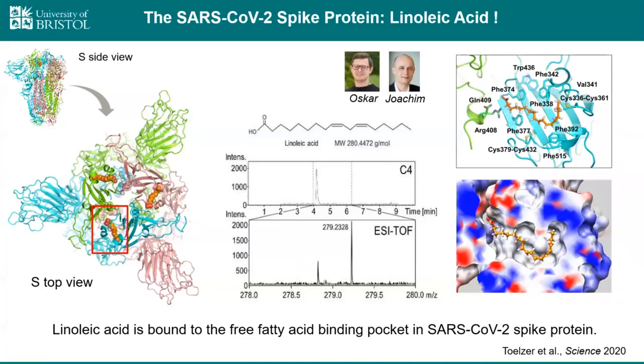And in the meantime, we also analyzed a second spike protein, which is a variant that has been discovered in Bristol. And we have done LC-MS with linoleic acid as the standard, and there we could show that indeed, yes, this is linoleic acid.